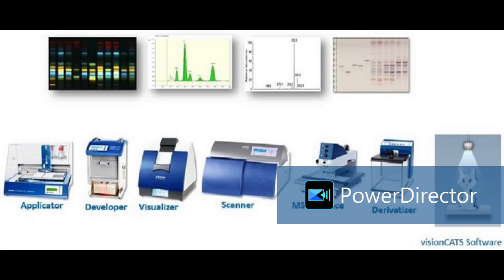Here an applicator is required, here a development chamber is required, here a photo documentation visualizer is required, here a scanner is required, and here a derivatizer is required. So all these modules are connected together in the software. In software we can make a program, we can give commands, and we can transfer the plate from one module to another after completion of each step.